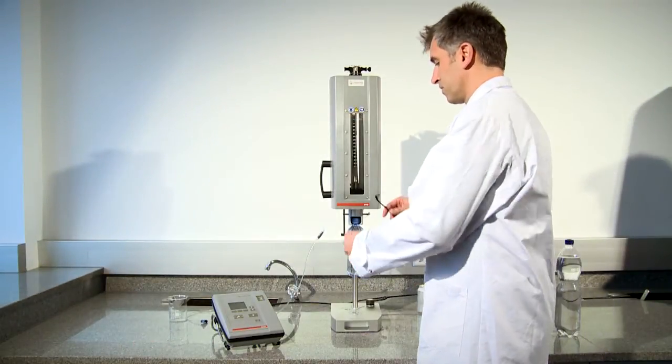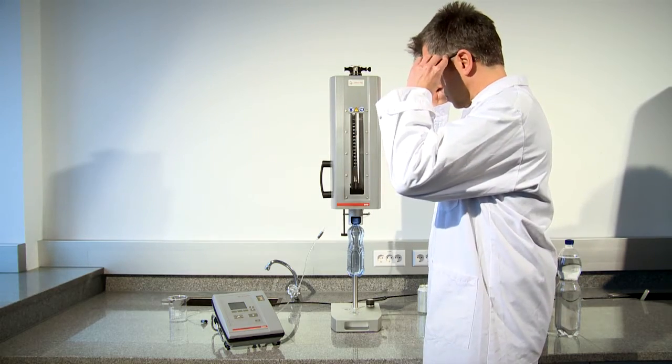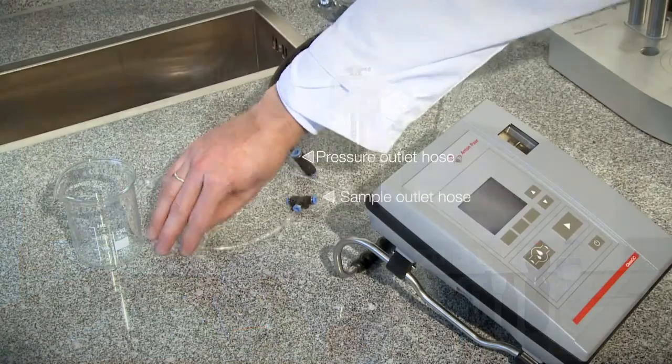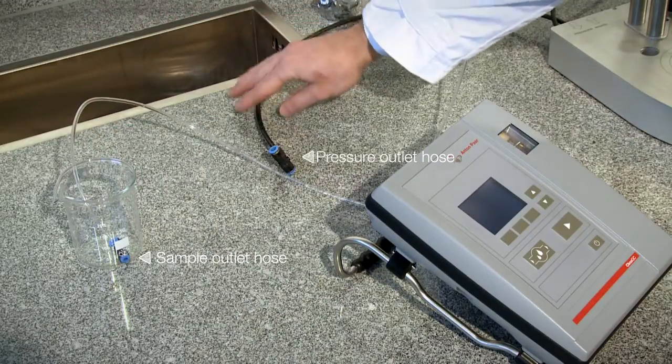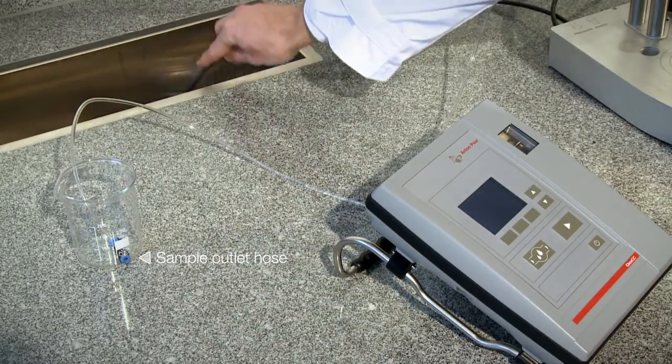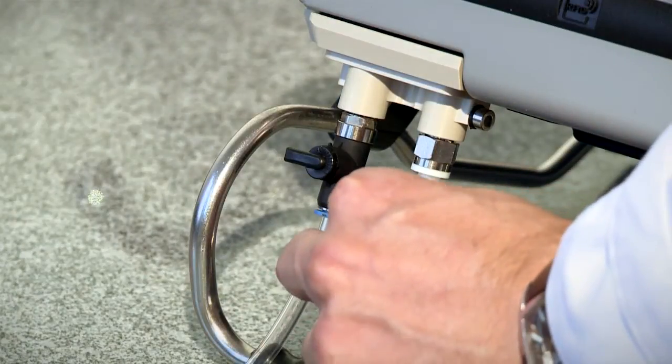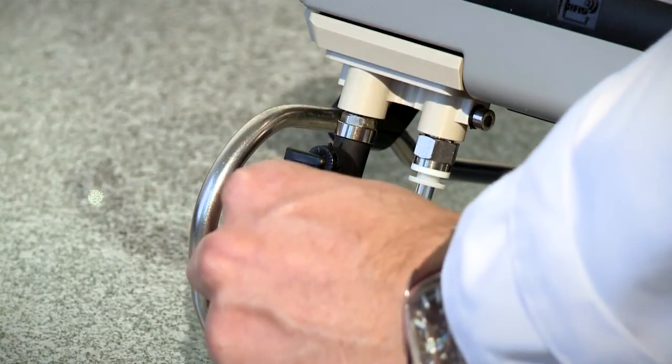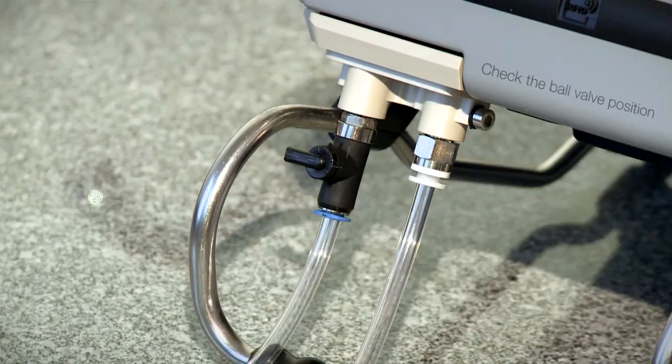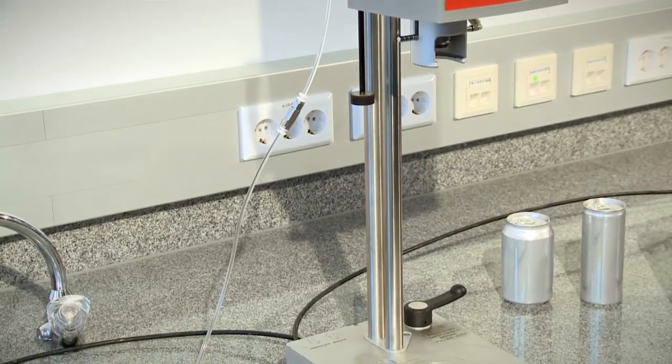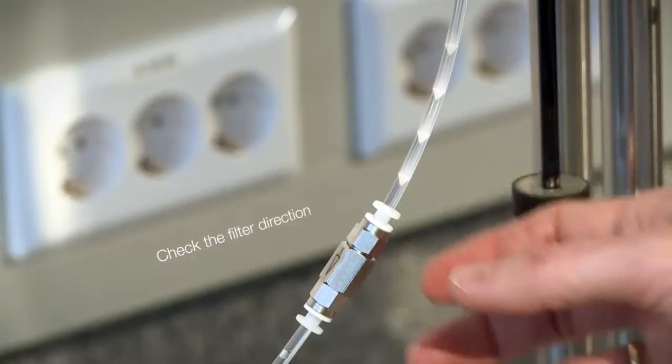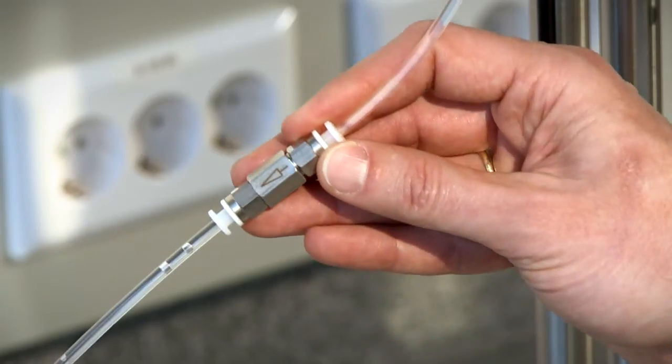You can start a measurement after a few short steps only. First, lead the sample and the pressure outlet hoses into a waste vessel. Make sure that all hoses are tightly fixed. The ball valve in the back is fixed in the position you see here, and that the filter between the PFD and the instrument's sample inlet is correctly implemented.